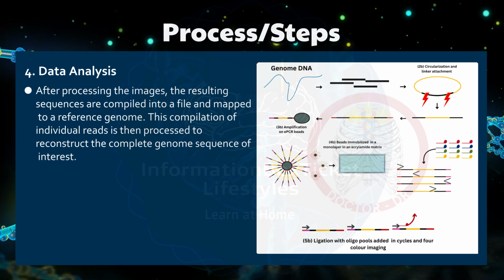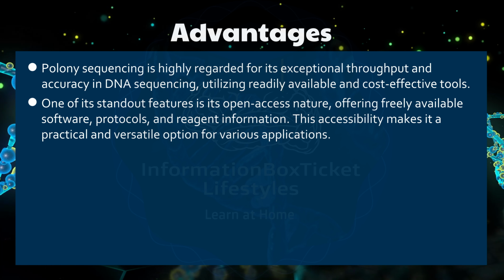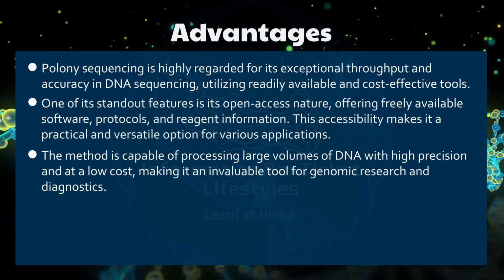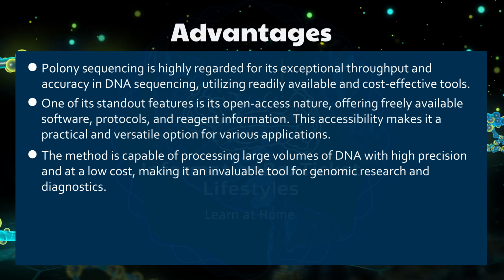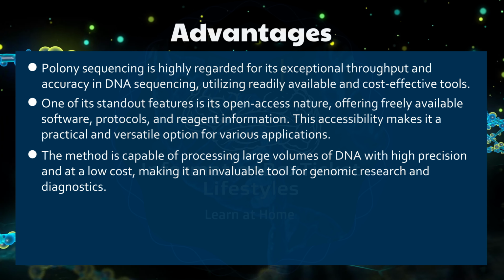Advantages of Polony sequencing. Polony sequencing is highly regarded for its exceptional throughput and accuracy in DNA sequencing, utilizing readily available and cost-effective tools. One of its standout features is its open-access nature, offering freely available software, protocols, and reagent information. This accessibility makes it a practical and versatile option for various applications. The method is capable of processing large volumes of DNA with high precision and at a low cost, making it an invaluable tool for genomic research and diagnostics.